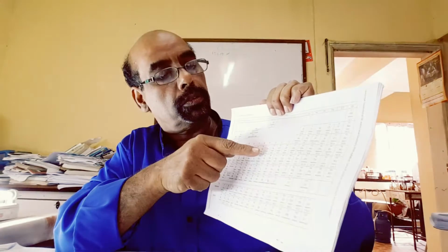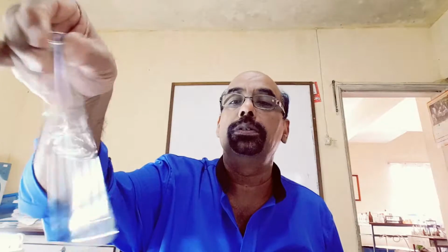Iron is a transition metal. This is the transition metal region. So since iron is here, it is a transition metal. Its ions or hydrated ions are colored. Aqueous iron 2 ion is green. This is iron 2 ion. It is green. It is dilute, so not so green, but it's green.